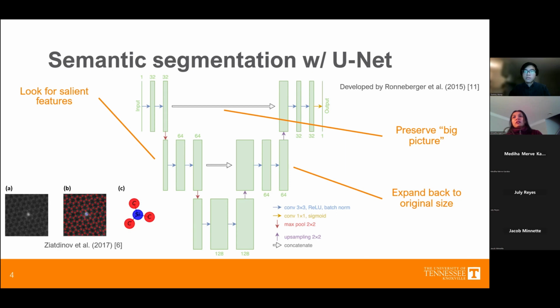So you have lost all the boundary information. Now your image is very low resolution. And now when you add skip connections, you are directly adding, are you doing concatenation, or are you just adding when you add the output of skip connections with the input of the image? What are you doing?